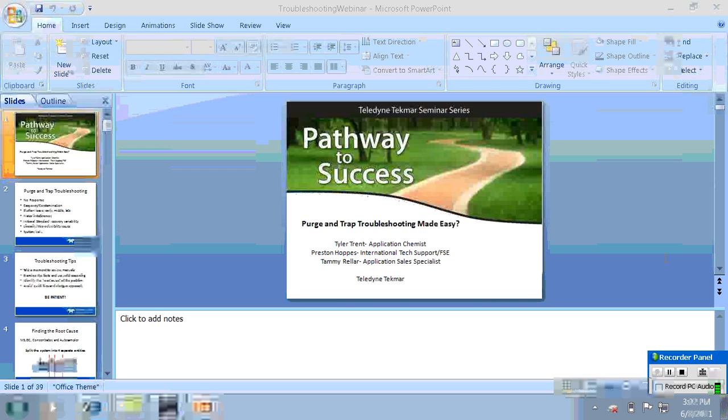We did have a few questions, and we also addressed internal standard precision as well. So we went through all of the questions that were sent in, and we were able to consolidate most of them into those categories: carryover, water interference, internal standard precision, and trap maintenance. If you have any more questions, we're going to take a look here and see.